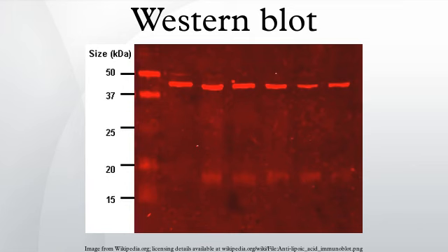Secondary antibody: after rinsing the membrane to remove unbound primary antibody, the membrane is exposed to another antibody, directed at a species-specific portion of the primary antibody. Antibodies come from animal sources. An anti-mouse secondary will bind to almost any mouse-sourced primary antibody, which allows some cost savings by allowing an entire lab to share a single source of mass-produced antibody, and provides far more consistent results.